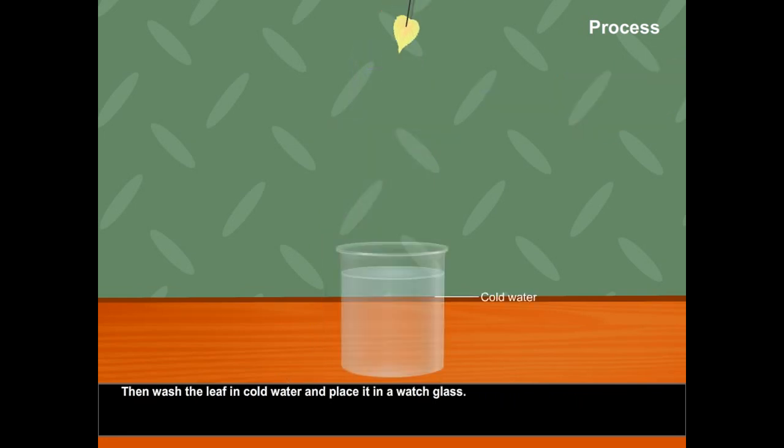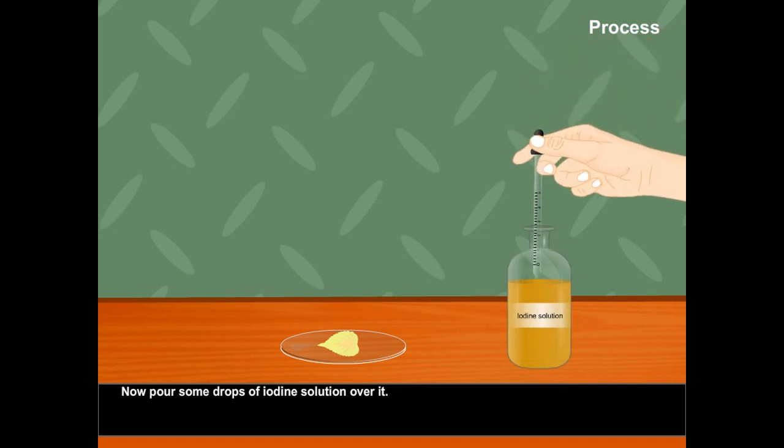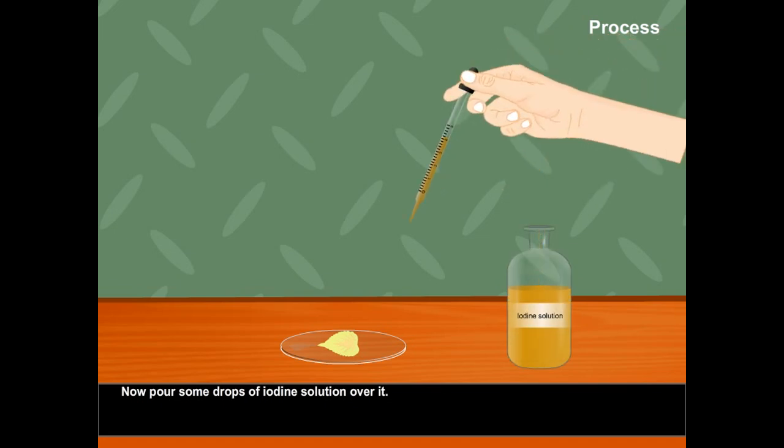Then, wash the leaf in cold water and place it in a watch glass. Now, pour some drops of iodine solution over it.